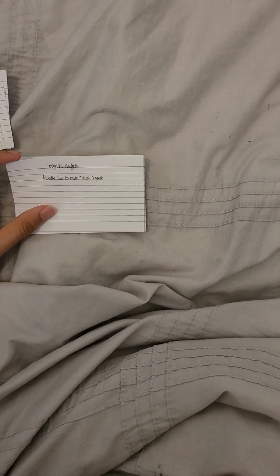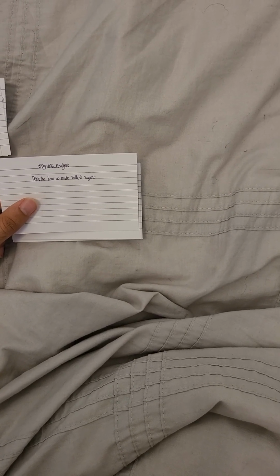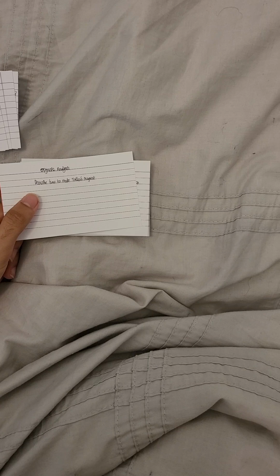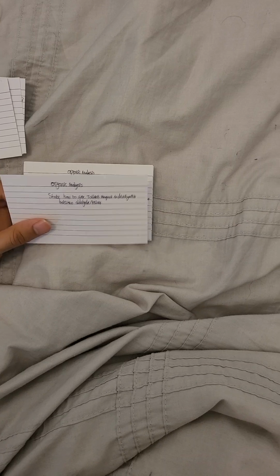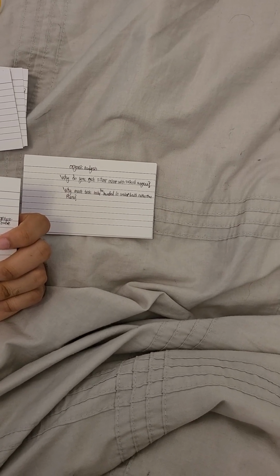How to make Tollens' reagent. So we add 2 cm³ of 0.1 mol dm⁻³ silver nitrate solution to a test tube. Add a few drops of dilute sodium hydroxide and a light brown precipitate forms. Add drops of dilute ammonia until the brown precipitate dissolves completely. And then how to use it: we add 2 cm³ of Tollens' reagent, place the test tube in a hot water bath. Add 10 drops of aldehyde or ketone.